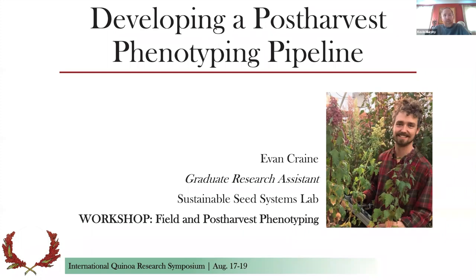Evan helped develop a near-infrared analyzer calibration for estimating whole seed quinoa and sample composition, specifically protein content and quality, and a seed scanning system using flatbed scanners. These tools support the WSU quinoa breeding and research projects and are available to collaborators interested in applying them to their research objectives. So Evan will give us an overview now of what he has done.